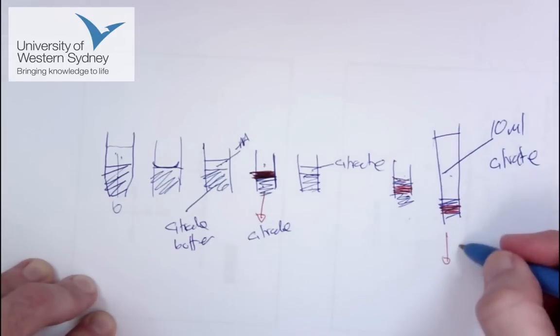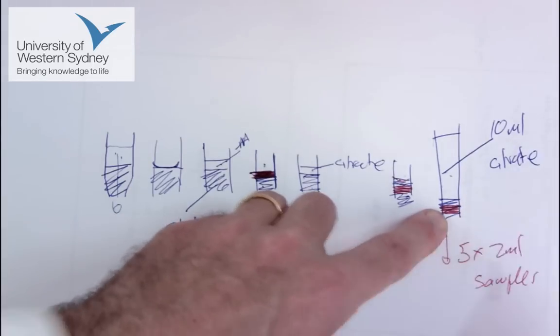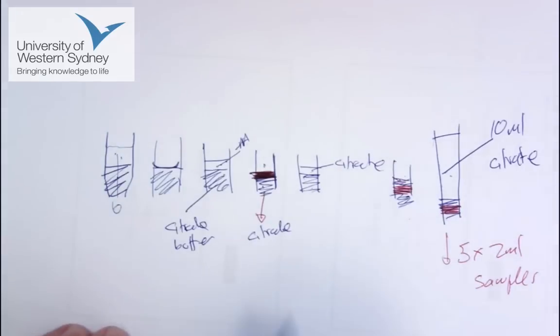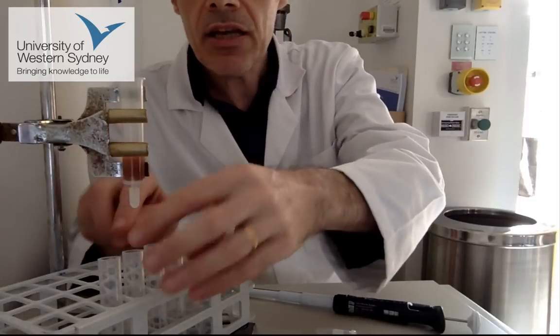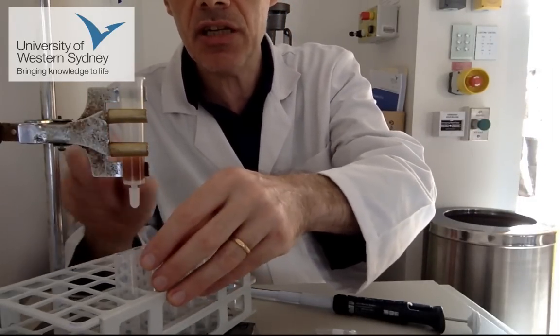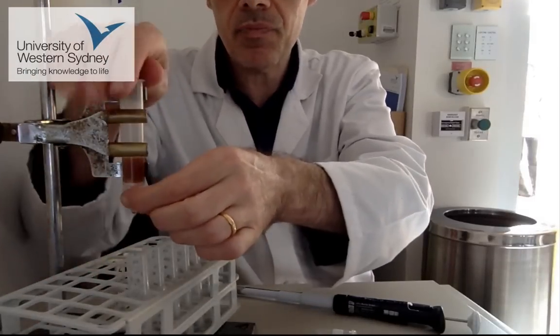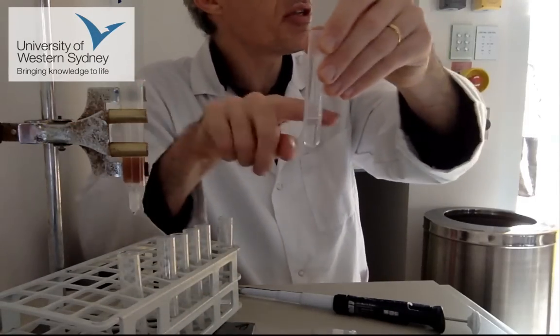So now when you do your 5 times 2 mil samples, you can be sure that the amino acid was already in the column before you started the big load. So that's the series of steps that you're doing to set up the procedure. Or you just follow the procedure, and then you collect 2 mils in each of these tubes. So if I was to collect my first 2 mils of the first sample, and then I'd move the tube along and collect another sample. So in other words, you're going to collect lots of 2 mil samples here.